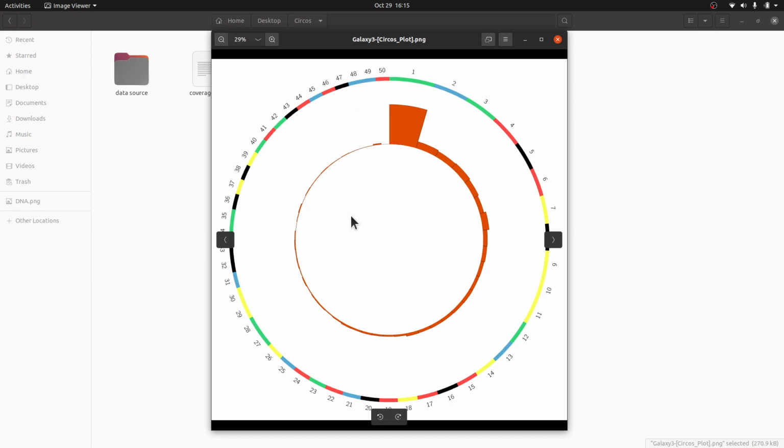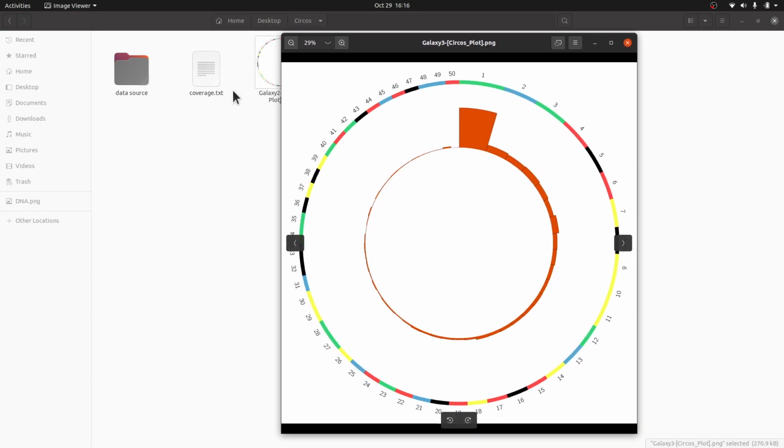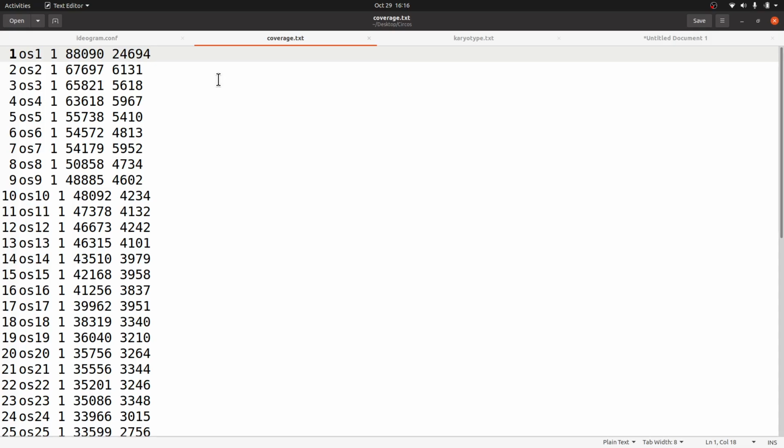All right, so Circos, when you generate plots like this, it also gives you a compact visualization. Okay, so I have come to enjoy it, and I'm going to be using it more. So if you also have challenges with running Circos or setting it up, you can also reach out to me and then we can work something out. The key thing is about you getting the information in the proper format like this, okay?